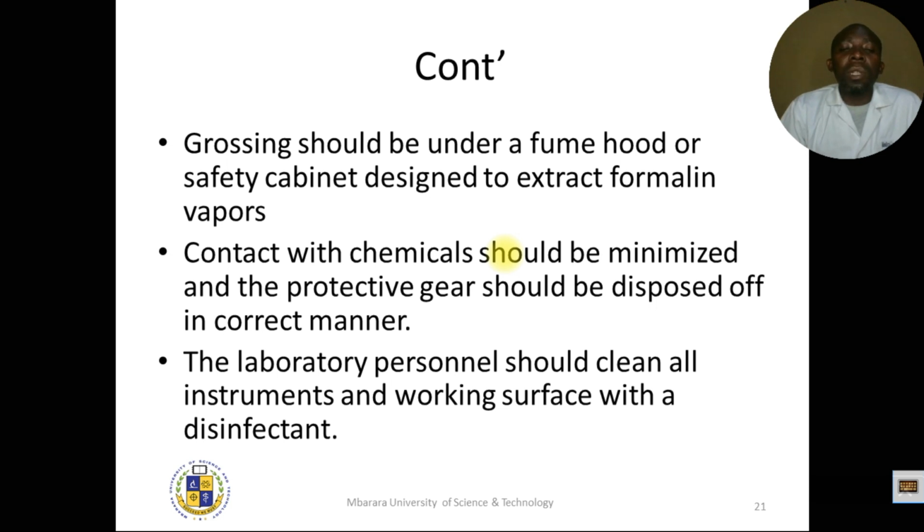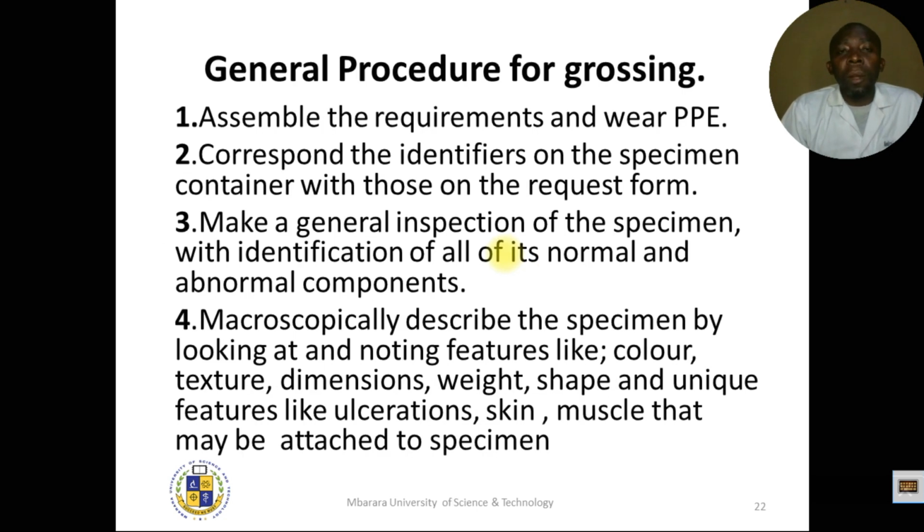We have for some time discussed infection control and waste segregation, different bins with the color codes, and this is what should be carried on even in the grossing room. You dispose of the used gloves correctly. So the laboratory personnel should clean all instruments and working surfaces with the disinfectant after use. You need to make sure that your equipment is clean before you keep it.